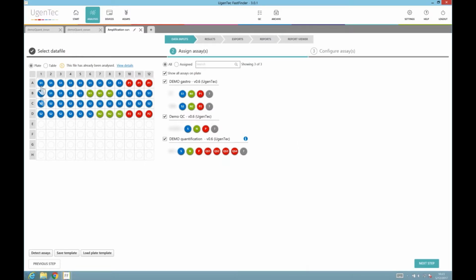for instance, mix 1 and mix 2 here, and at this point it's interesting to distinguish what we mean by multiplex, multi-well. A multiplex assay might, for instance, be a single sample in a single well that has multiple probes designed against different targets. A multi-well experiment might be that a sample is spread across 2 or more wells.